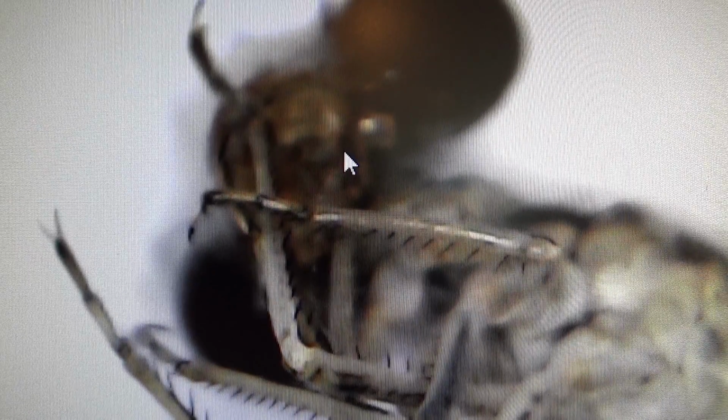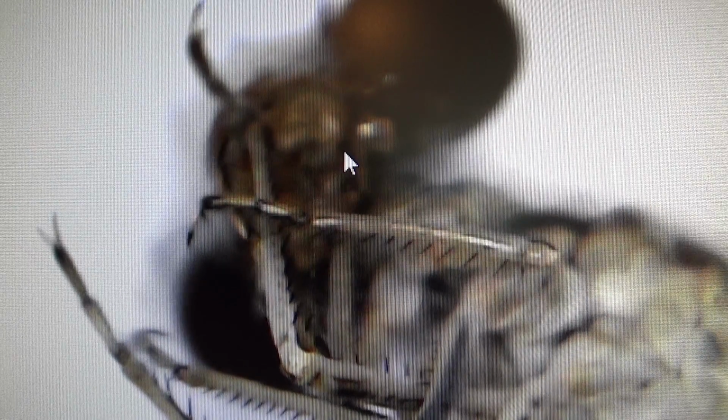So look at that. Now this is on the microscope. I'll show you how tiny he really is after, but look at this. On the legs, when you look at it with the visual eye, you don't see those tiny little hairs. Look how tiny they are. They're like little whiskers, all over the arms. Look at that. Let me take you through the whole body. I mean, look at all of this. The little arms. Got a lot of little arms, don't they? Wow.